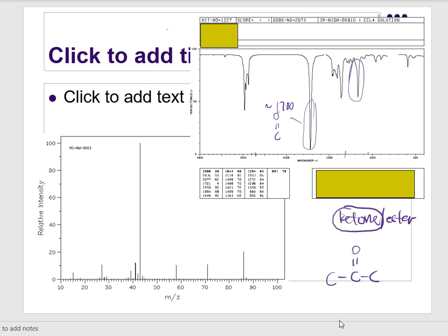All right, so I at least can use this as a building block to figure out what type of compound I have. Over here in the mass spectrum, it looks like the base peak is here. There's 40, 41, 42, and 43. And then here at the M peak, there's 80, there's 85, and it looks like it could be 86. Notice that little bitty squiggle right there.